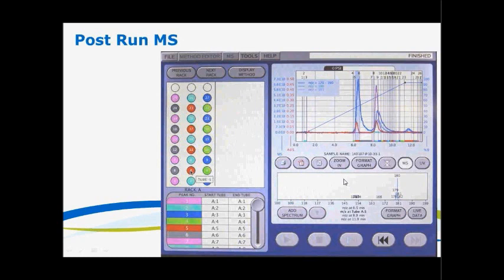So if we started to see an impurity form, we'd see that impurity down here in the mass spectra data. And so therefore we could know that, let's say, tube A5 and A6, which would be this area, we could decide if we wanted to put those together or evaporate those down and keep them separate, because one might have a contaminant that's not in the other.